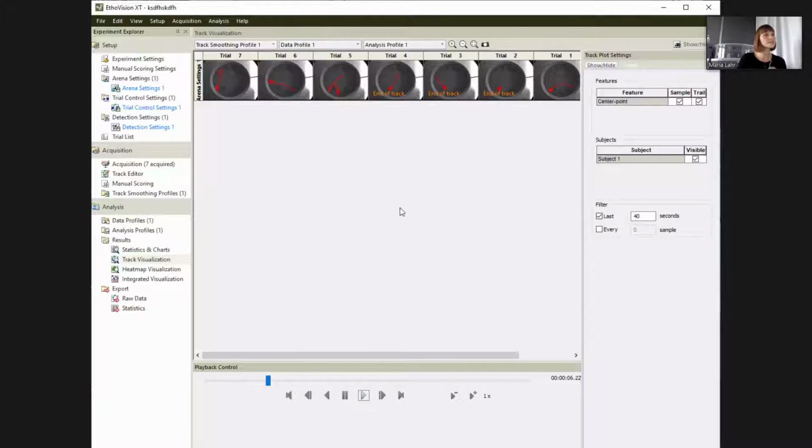So the point is that you should realize that 6 of these videos are from the learning curve. So they are showing mice that are looking for the platform. And one video is a bit different because this is a probe trial in which the platform is removed and the mouse, in this case, as you might guess, is already pretty good and is looking for the platform but cannot find it. And to distinguish these is very important for the task that you have to do, because you don't want to plot this one video in your latency curve. It makes no sense, obviously.